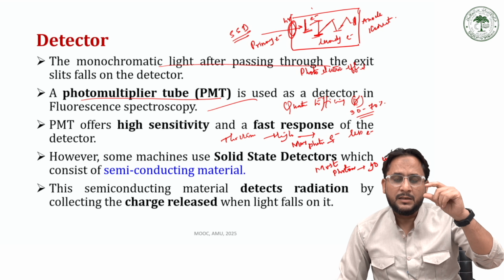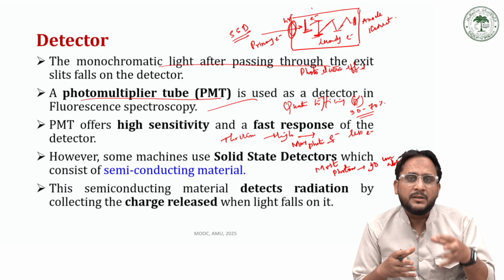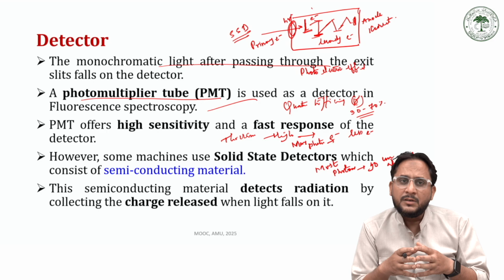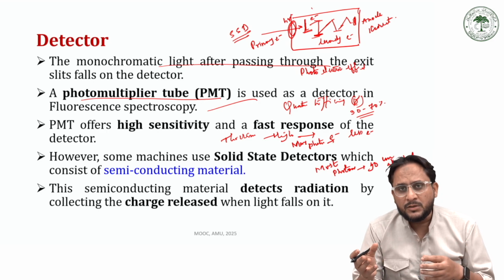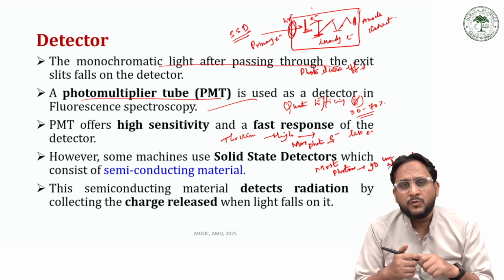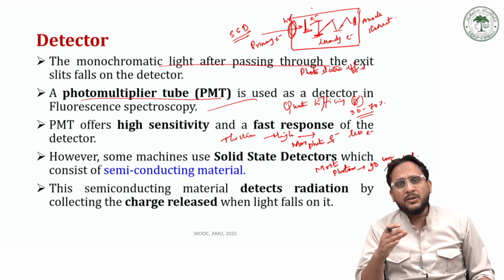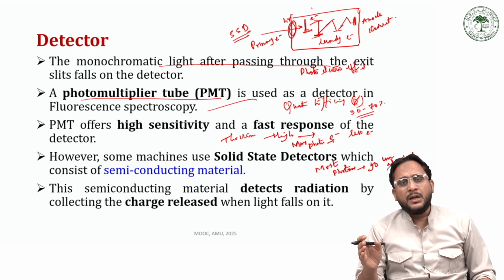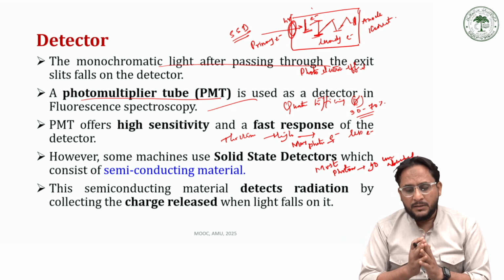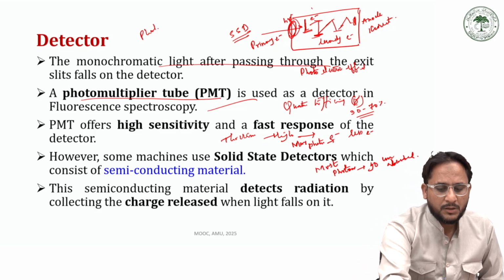the thickness of this photocathode is high, electrons will not be ejected even after absorption of a large number of photons, which means that after absorption of a large number of photons, only very few electrons are being emitted. On the other hand, if the thickness is very small, if it is very thin photoconductive material used for making this photocathode, then many of the photons go unabsorbed, and when they are not absorbed, no electrons will be ejected from the photocathode. Clear?